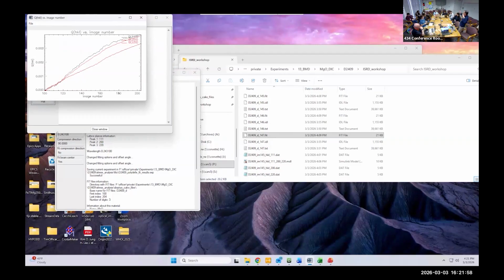And that's only one bound. There are two extremes, right? We have the Reuss bound, and also the isostrain bound. We can't do the isostrain bound because grains cannot overlap. But when you do the Reuss, you're assuming that every grain in that orientation feels the same stress, which is also not true. And that's why Pam used the self-consistent model to get a better estimate of this. But the self-consistent model is also not perfect.